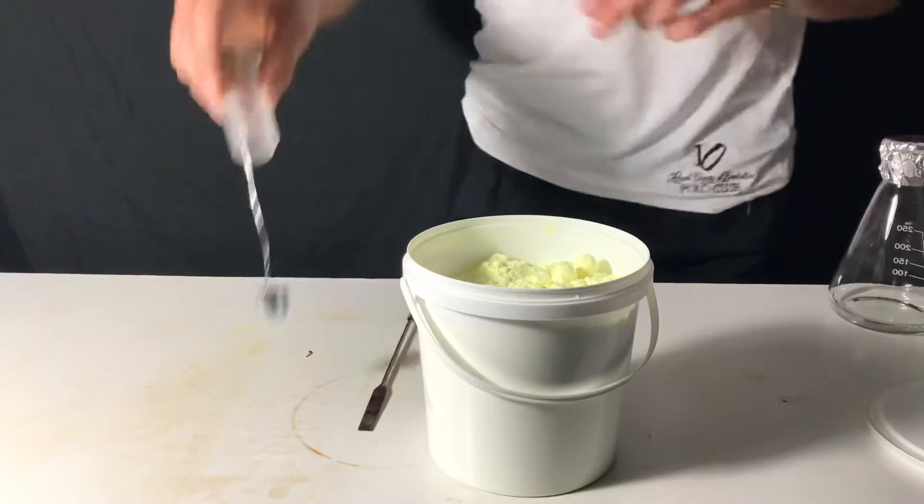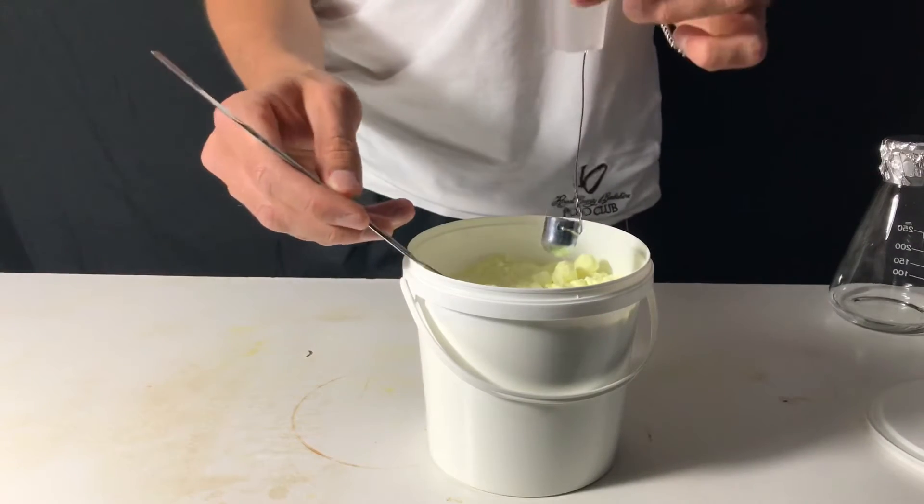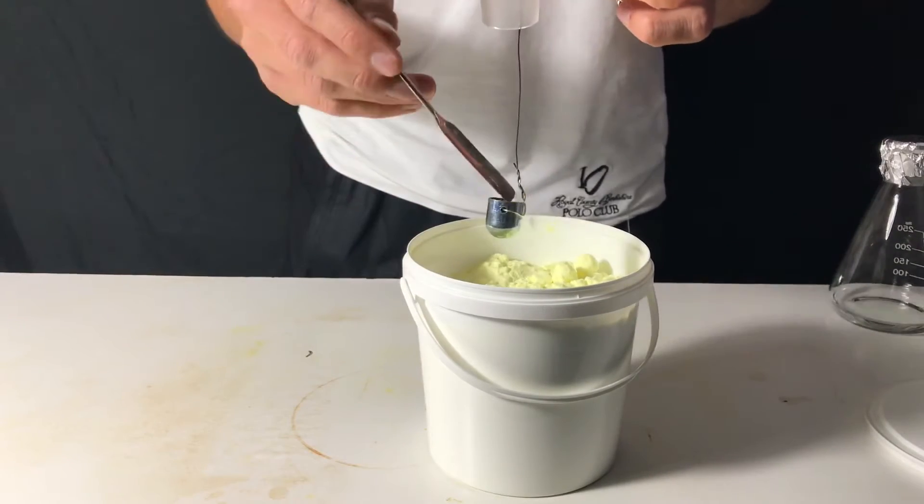We start off by adding a really small amount of sulfur to our burning dish.